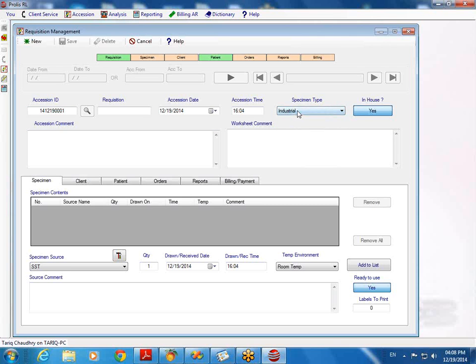No, I understand, but I mean, we wouldn't ever need to use the option of industry or regulatory. Instead, we would have research samples. Oh, research samples. So I know that you said that the user can't add specimen types, but is that something that you could change when you design or customize the database for us? No, actually that won't be possible.